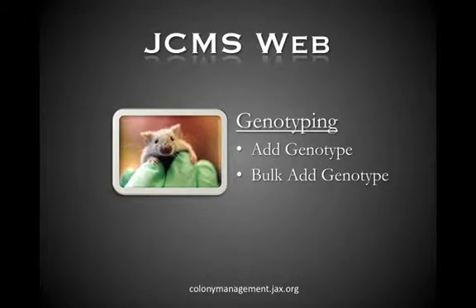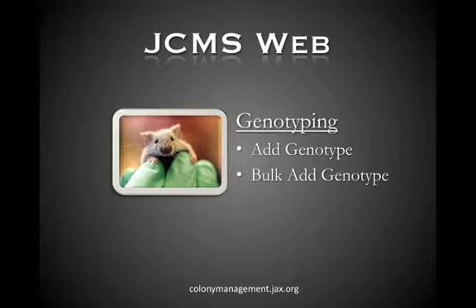Welcome to the JCMSWeb basic training video tutorial program. In this video I'll show you how to add genotypes to mice and I'll also show you how to add genotypes to multiple mice using the bulk add genotype feature. Let's get started.